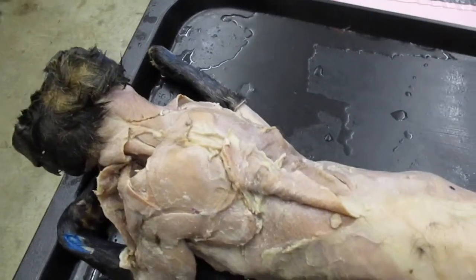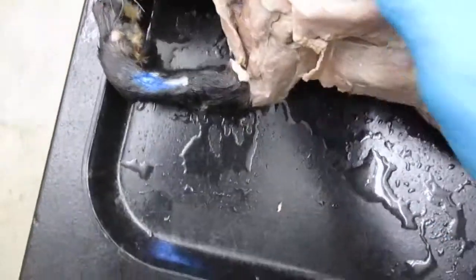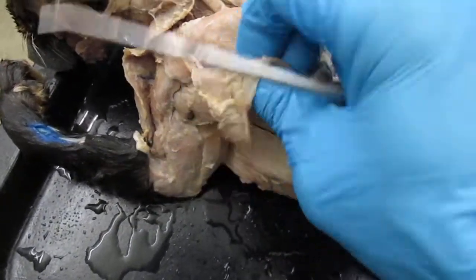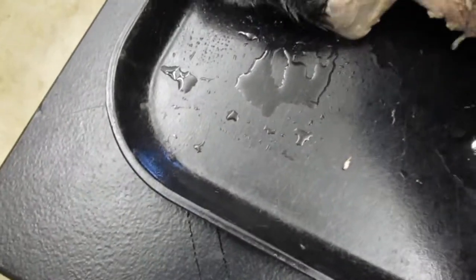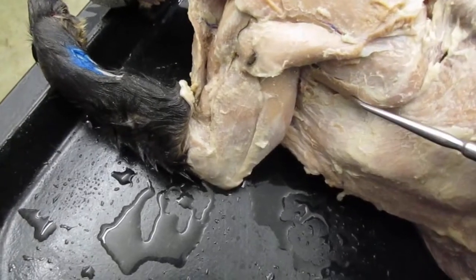Okay. And I think we're good all except for the subscapularis. So the subscapularis is right here. So here's your subscapularis right there. So I'll just show you those muscles again. Supraspinatus, underneath the acromial trapezius. And then we can see the infraspinatus right here, teres major.